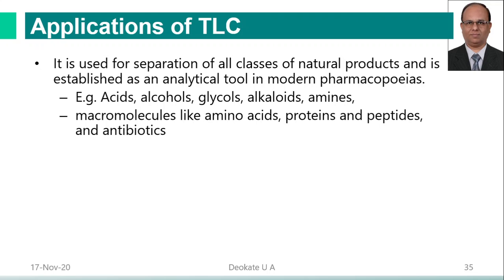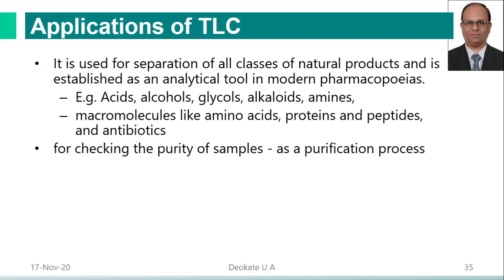It is used for separation of all classes of natural products and is established as an analytical tool in modern pharmacopoeias. It is used for determination of acids, alcohols, glycols, alkaloids, and amines. It is also used for separation of macromolecules like amino acids, proteins, peptides, and antibiotics.